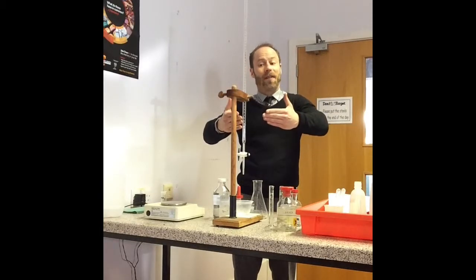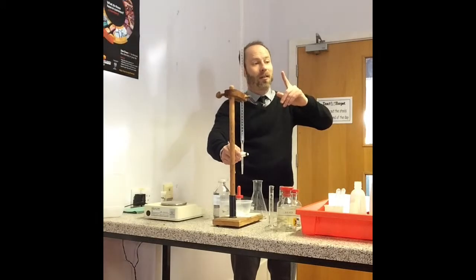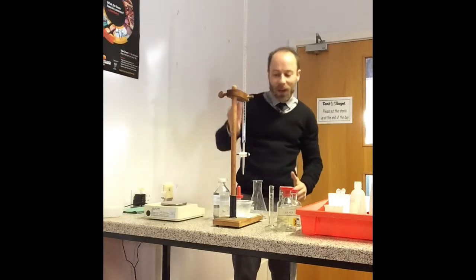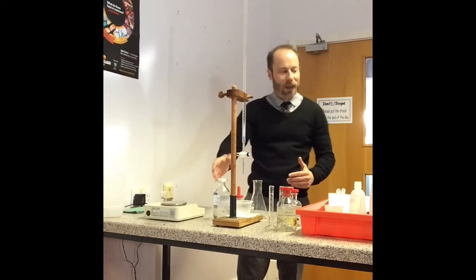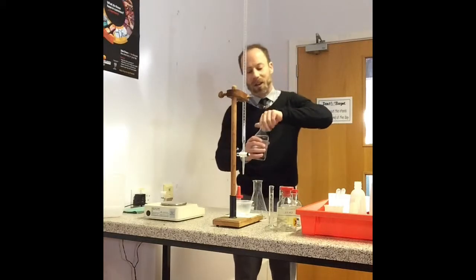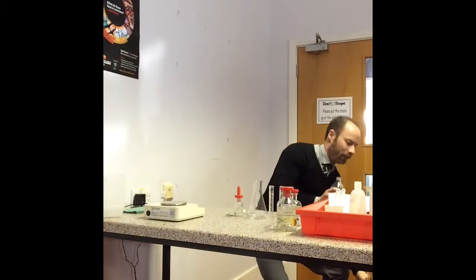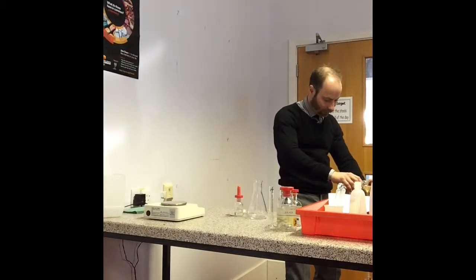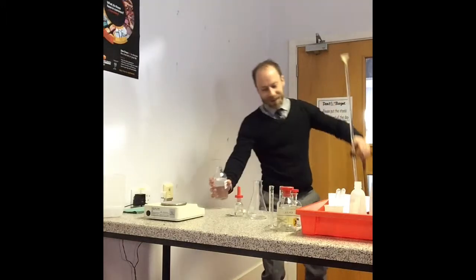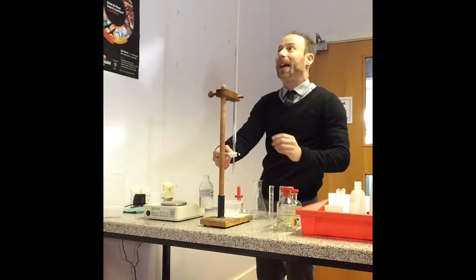So this is the burette. I'm going to fill up the burette with my sodium thiosulfate. Normally, of course, we would wash with distilled water and then wash with the solution as well. I'm going to have air in here, so I'm just going to let it out a little bit.